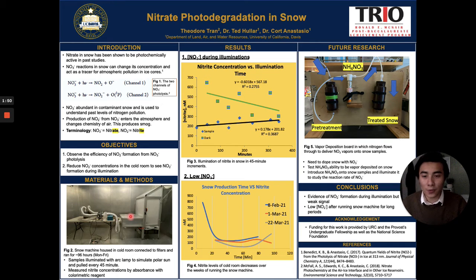This chamber holds our water tray as well as a heating element, where we incorporate principles of supersaturated water vapors to form snow crystals. As water is heated up and steam is made, a flow of air pushes it into this box. This box has a bunch of nylon string attached horizontally left to right. Snow crystals form on these strings, and over time they drop into our collection bin right here.